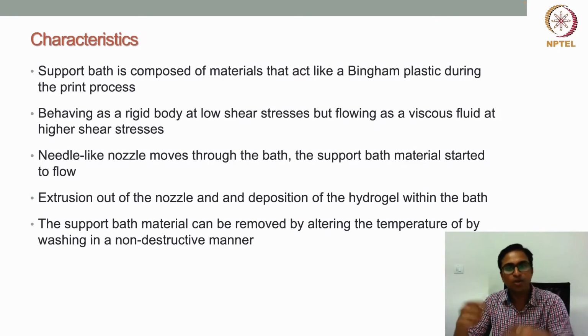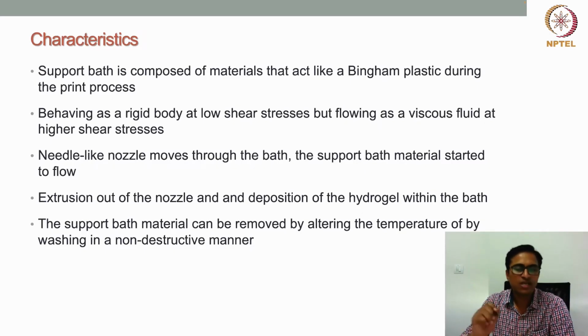Now, after the whole process is done, how can we remove the support bath material? Mostly the support materials we use can be removed in various ways. One way: suppose we use a thermoreversible material, meaning the material behaves like a gel at a certain temperature, and above a critical temperature it behaves like a liquid.